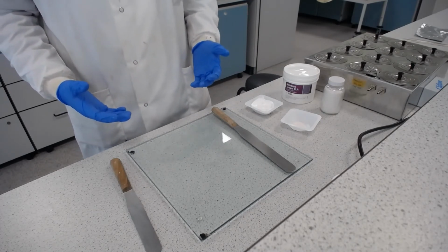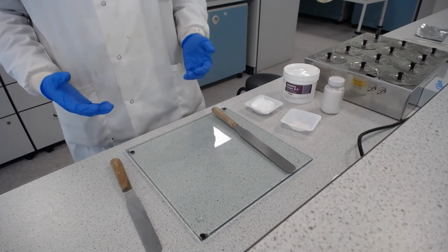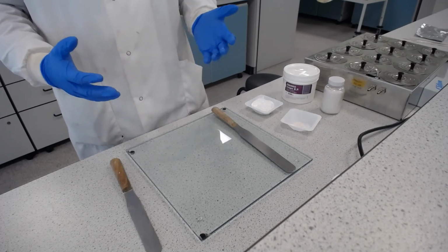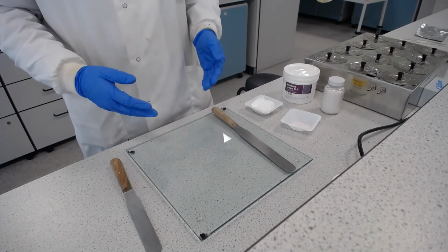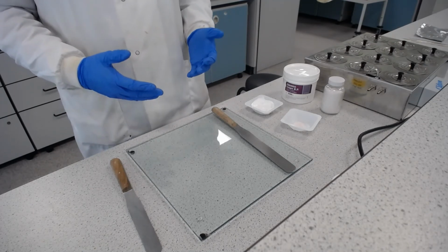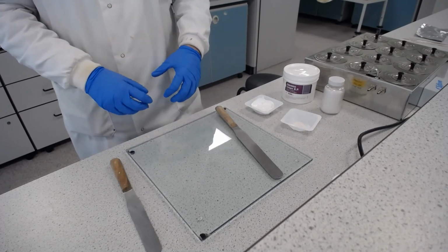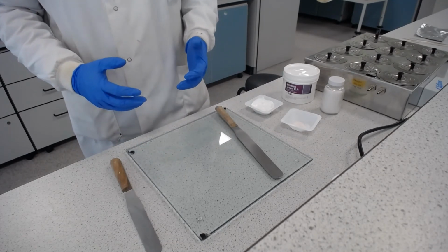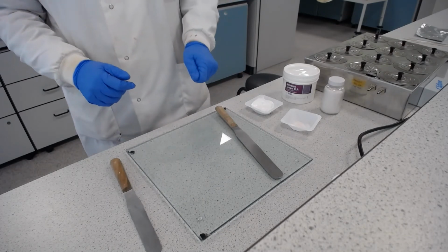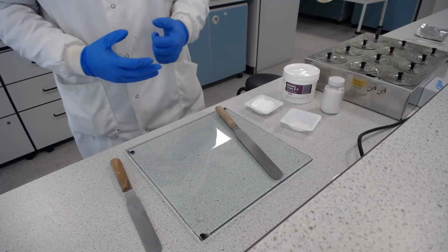So in your packs, we've explained that that's when an insoluble powder is reduced in size and incorporated into a base whilst wet. Now this is achieved in the lab by rubbing the powder in a small amount of the base, so that's why it's wet, and we do that using a palette knife on a slab. And this is until the grain size is reduced sufficiently that it's not feeling grainy and not showing to be grainy, and also that the powder is fully incorporated into the base.